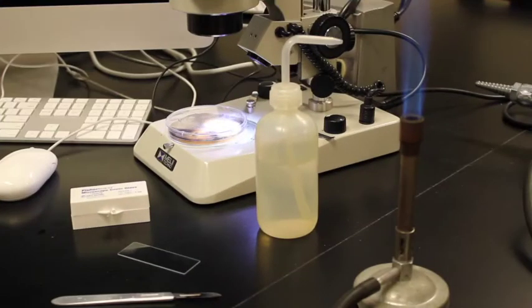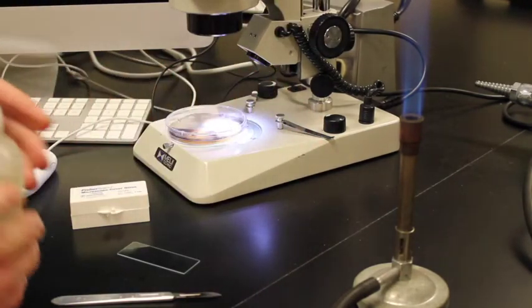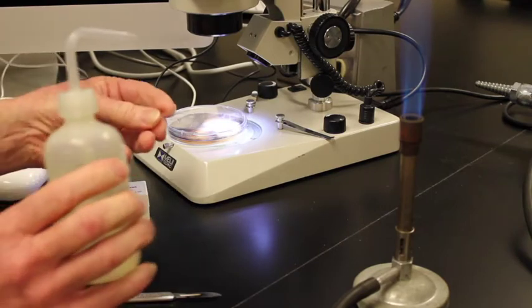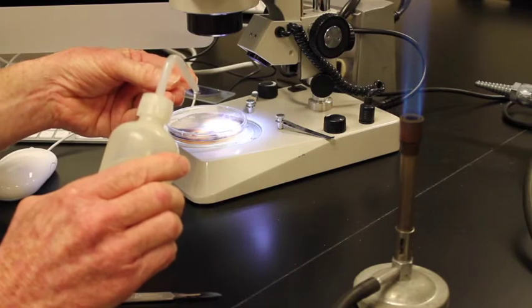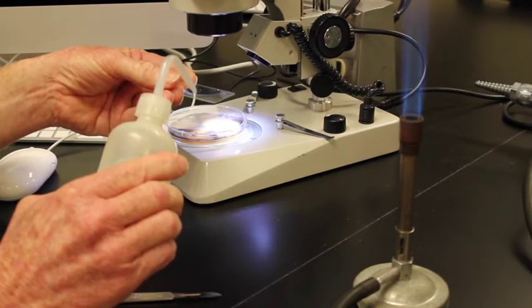All right, the next step is to actually make the wet mount. So to make the wet mount, I'm going to take a water bottle and we'll put a drop of water on the slide itself.